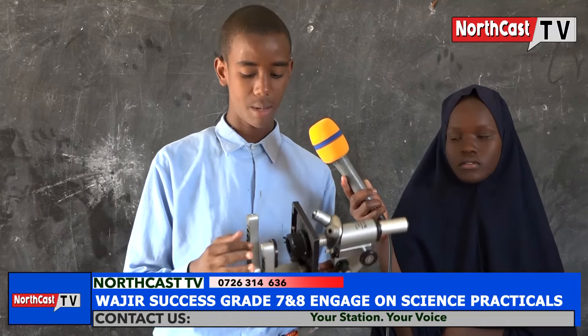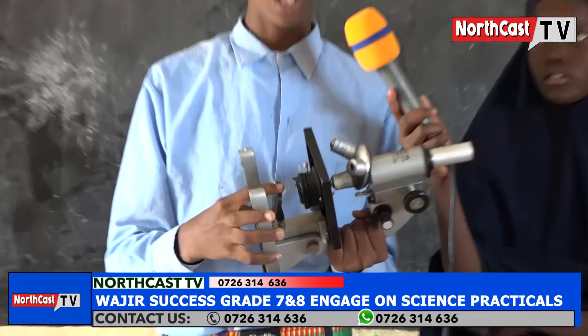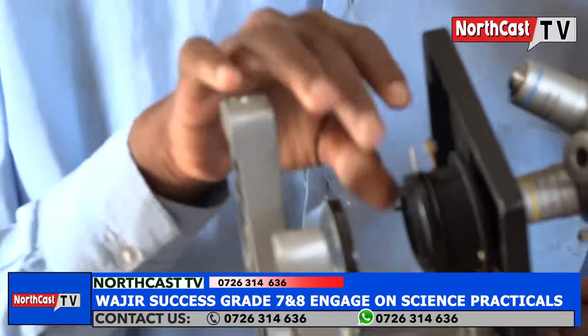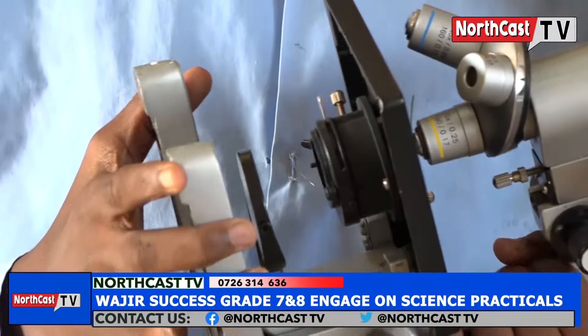The other one is the mirror. This is the mirror. The mirror reflects light through the condenser onto the stage. The other one is the condenser. This is the condenser. The condenser concentrates light onto the stage.